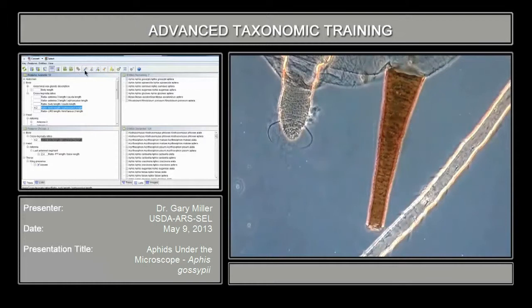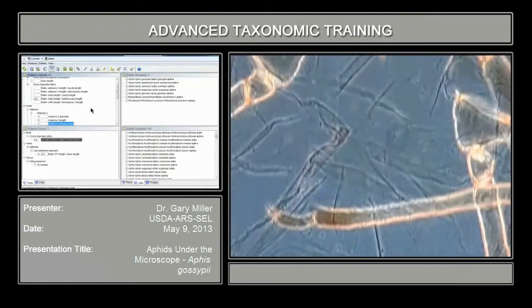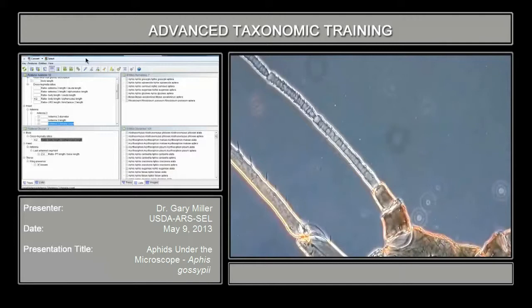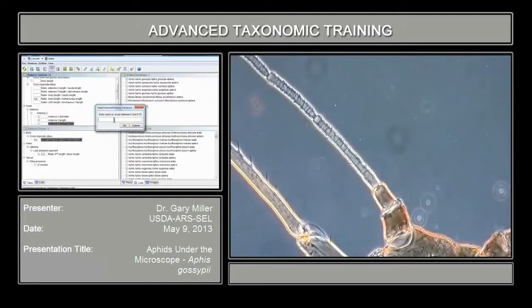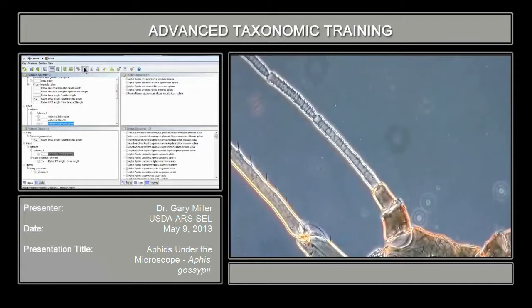The next feature is the antenna 3 rhinaria count. We're moving up to antenna segment 3 and looking for rhinaria — the sensoria — and these aren't present on antenna 3 of this specimen. They want us to enter a value between 0 and 9.75; obviously that's an average. We're going to say 0 — I don't see any.